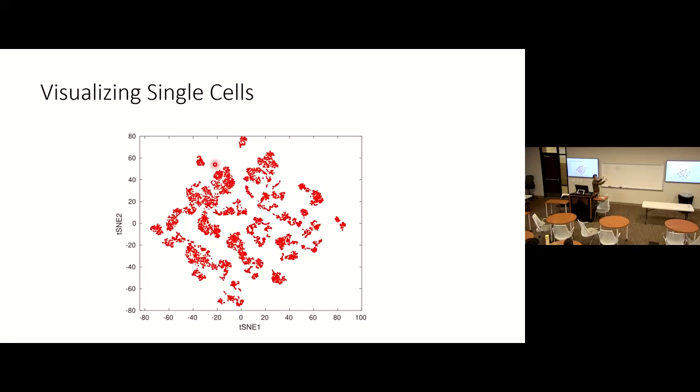So that's why, although PCA was invented so many years before, nowadays people do not use PCA for visualization directly for single cell data, but borrow the most recent data science development to use t-SNE to visualize data, because it's a very different approach.